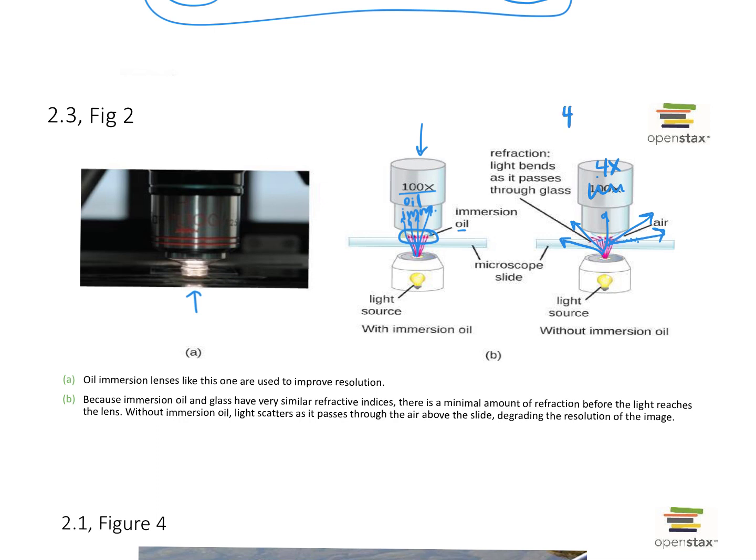The other lenses, the 4x, the 10x, and the 40x, are not designed to be used with oil. Now, it's not going to be a problem, especially at low power and medium power. If there's oil on your slide, you'll still be able to focus just fine. But for that longer objective, that high power one, if you get oil in there, it just junks it up and you're not going to be able to see clearly through there.